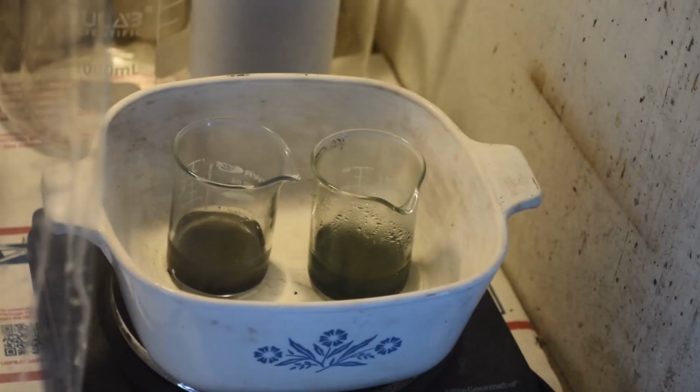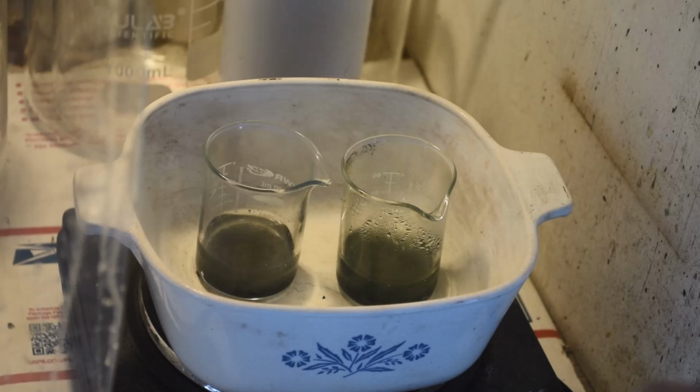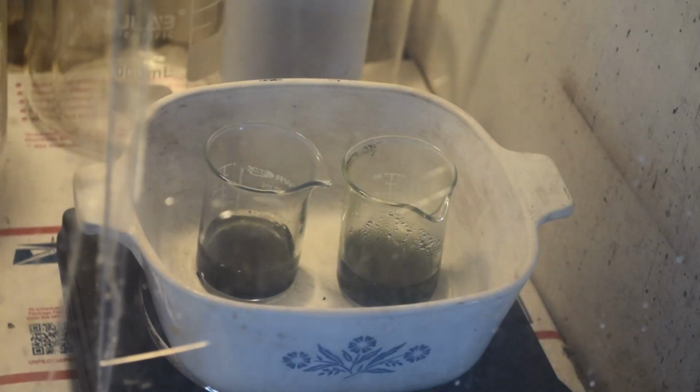Alright, after letting these go for about another hour, it's a little inconclusive about which I think is working better. Certainly there's more fuming off of the hydrochloric acid one, but that really doesn't tell me much about how fast the metal's dissolving. And there's actually fairly vigorous bubbling in both of them on pretty low heat. This is not hot at all, not like boiling or anything. So I'm just going to let these sit overnight, take a look at them in the morning since it's getting pretty late out here, and make a decision then. Because really at the moment it's just as clear as mud which of these I want to use.